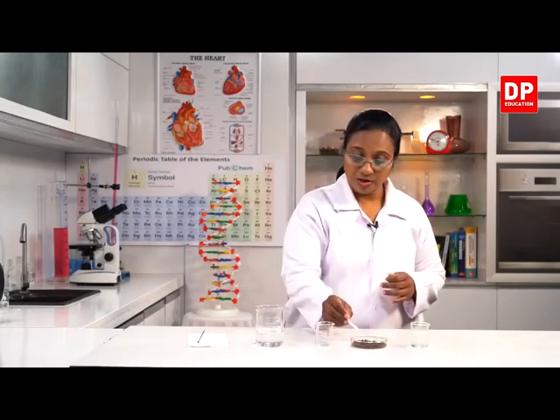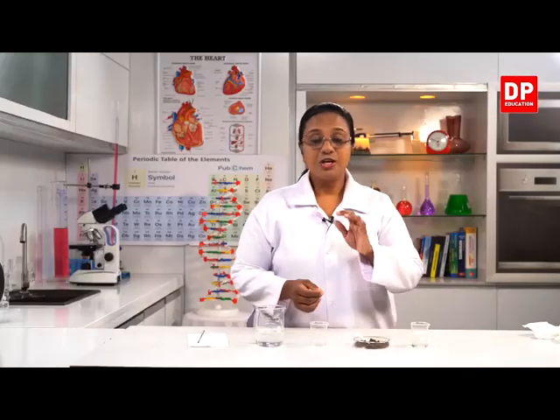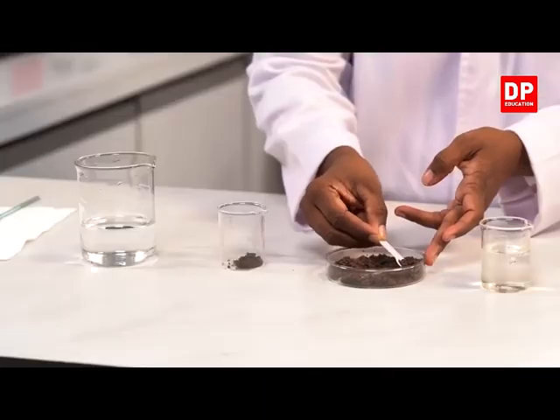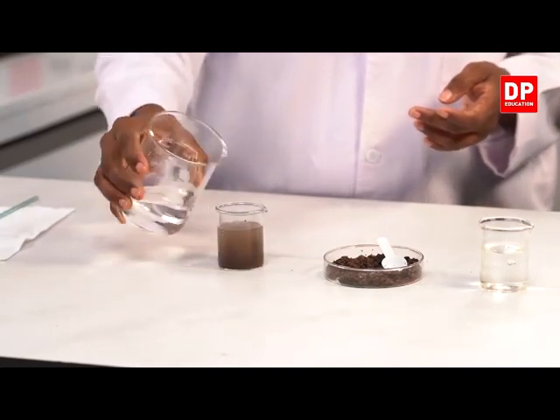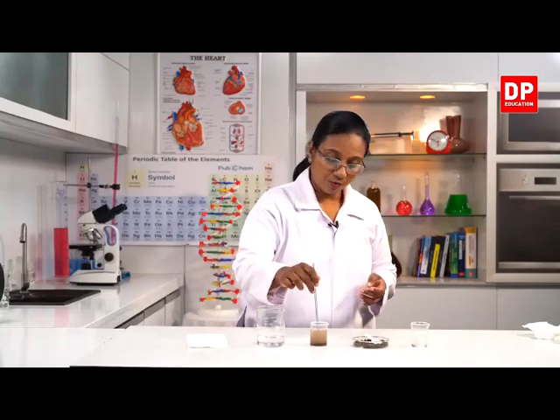Now we are going to observe the second type of mixtures, heterogeneous mixtures. You all know what we need to do. We need to take a small amount of clay, which I have here. Because I used 2 yogurt spoonfuls of salt in the previous activity, here also I'll be using 2 yogurt spoonfuls of clay. We take that into the beaker and add water. Again, you all know, students, this is a qualitative one. We are just going to observe.